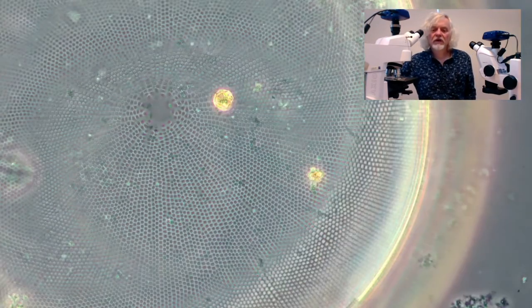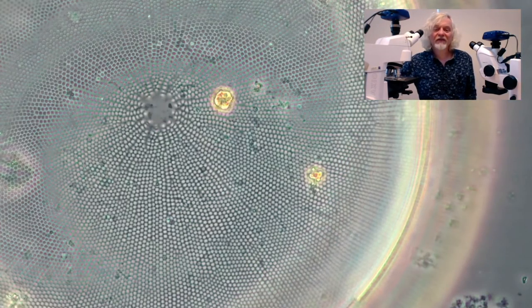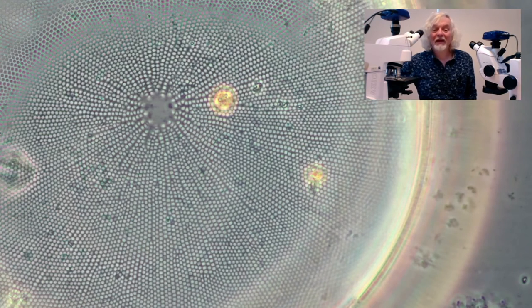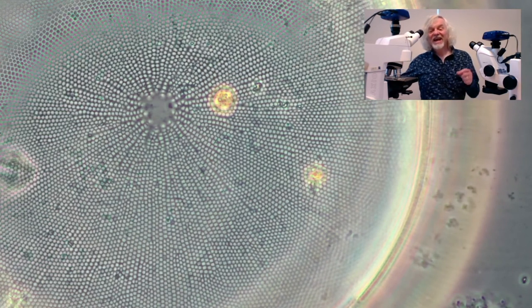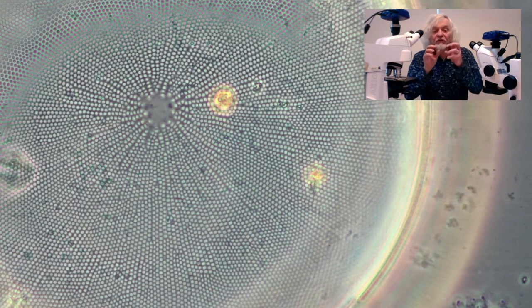and then focus, you can see, look at the fantastic patterning on the surface of that. That is a beautiful microscopic structure.